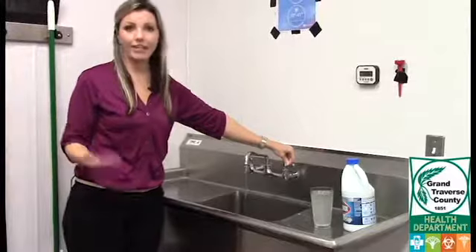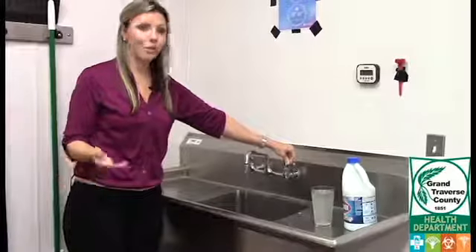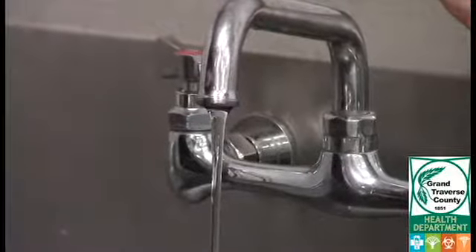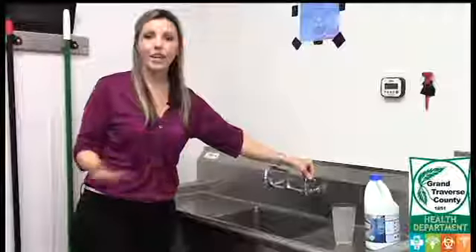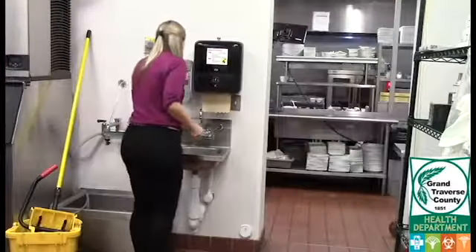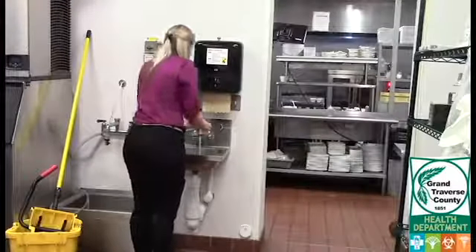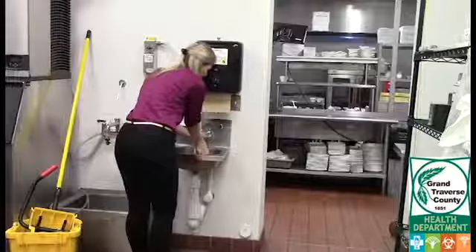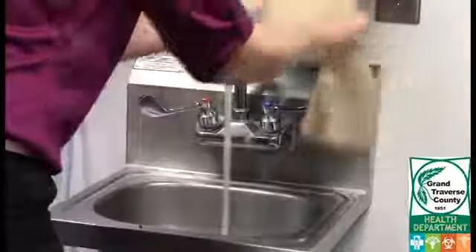Now we're at the final step of taking the actual water sample. First, adjust the water to a steady flow about the diameter of a pencil. Next, you're going to want to open up your sample bottle, but before you do that make sure to wash your hands. If you don't, there's a good chance that the bacteria on your hands could contaminate the sample.